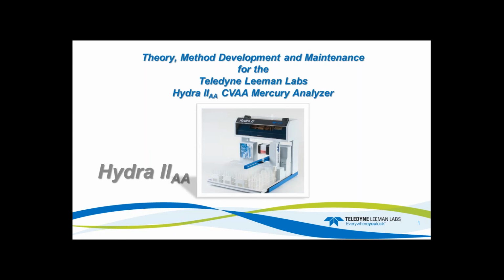Today I'm going to discuss Hydra 2 AA. We will go over some theory, a quick review of the software, and then some method development. I'm going to discuss 4 methods: an intermediate trace range, an ultra trace range, a PPB range that's conducive of EPA 245.1 type methodology, and then a high range where we will really push the instrument up to 1 milligram per liter. And then we'll end up with startup and shutdown, and then some basic maintenance of the system.